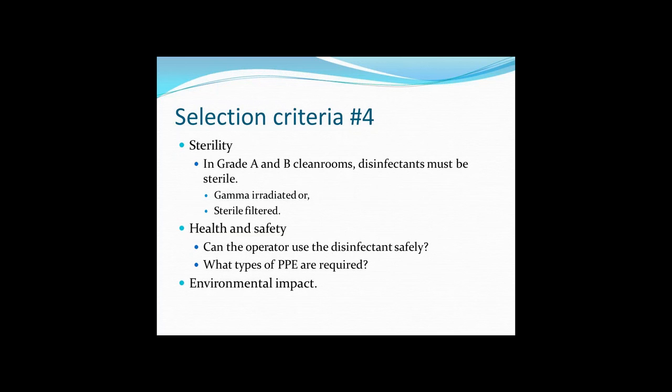Other factors to consider include sterility. For grade A and grade B clean rooms, disinfectants must be sterile. They can either be irradiated or filtered in. Health and safety is a key factor. Can the operator use it safely, and what types of personal protective equipment are required? And then there's the environmental impact. At the end of the work session, can you simply pour the disinfectant residue down the drain, or is that in breach of particular safety requirements? So you need to think about how that's going to be got rid of.